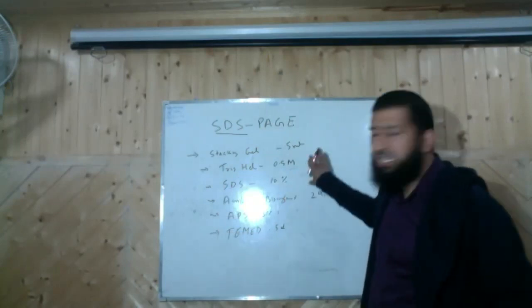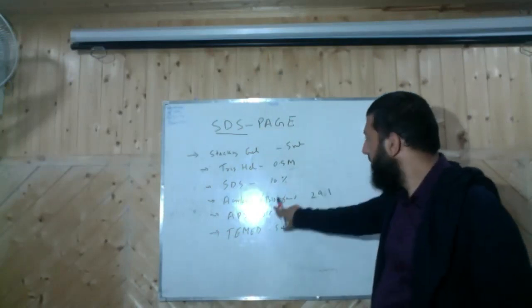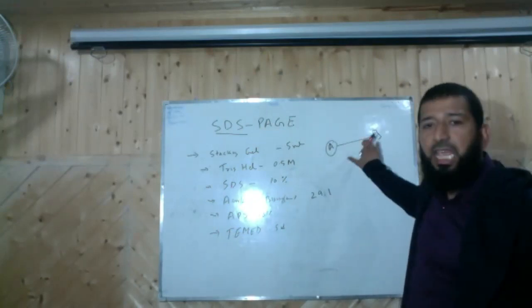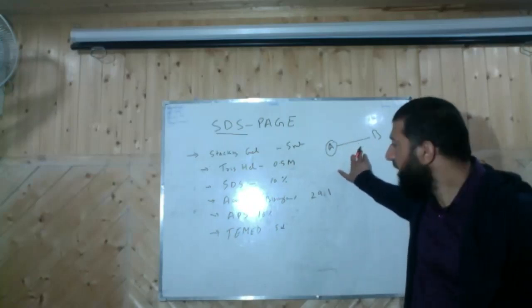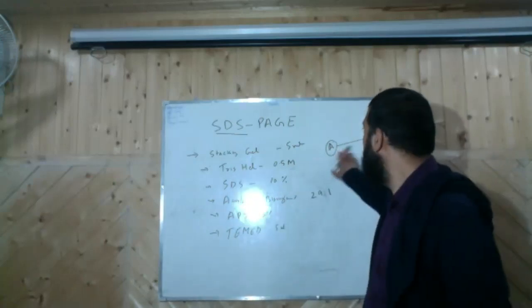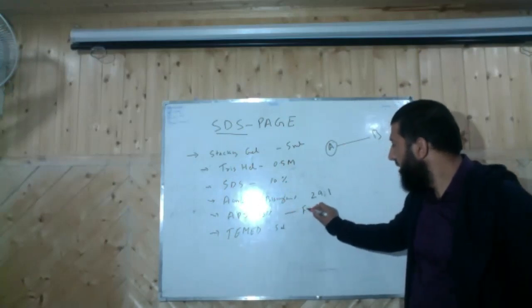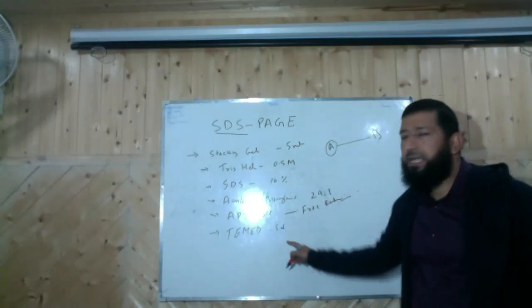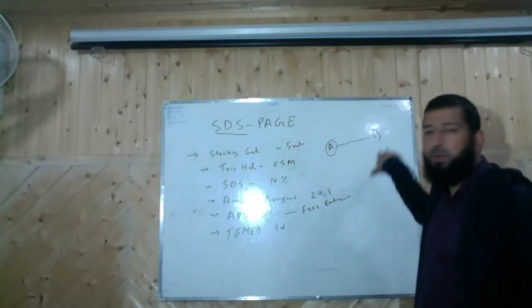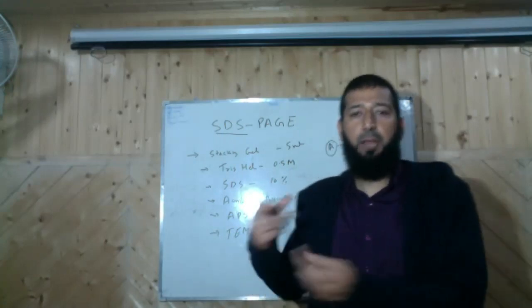In an agarose gel, the matrix is made by agarose. However, in SDS-PAGE, the matrix is made by acrylamide and bisacrylamide. They cannot form bonds and they cannot form a matrix on their own. That's why we add APS, ammonium persulfate. It provides free radicals that help in the bonding of these acrylamide molecules and bisacrylamide molecules. And TEMED acts as a catalyst. It catalyzes this whole reaction, the formation of this matrix, and joins acrylamide and bisacrylamide with the help of APS.